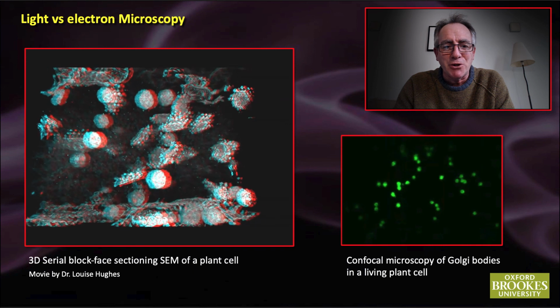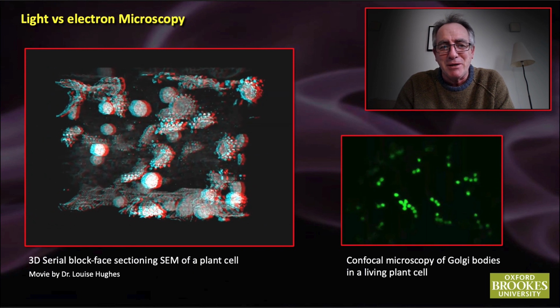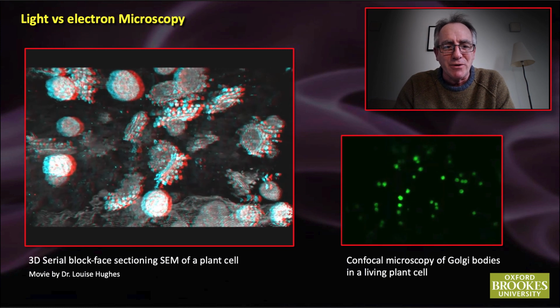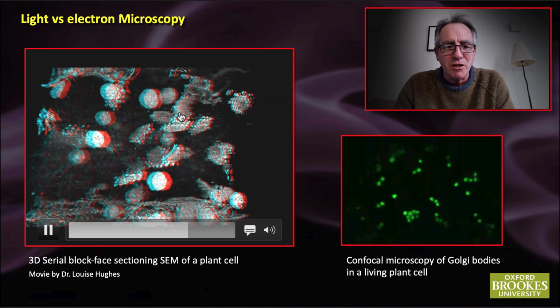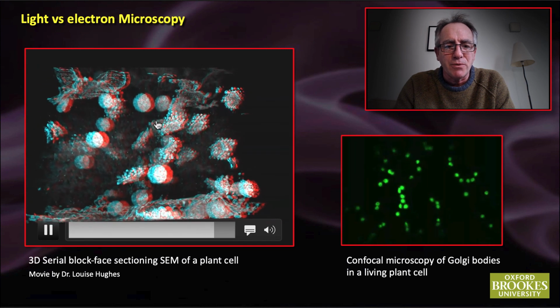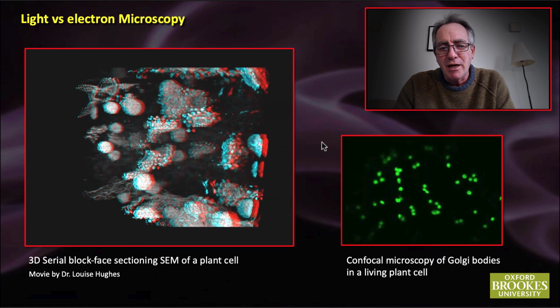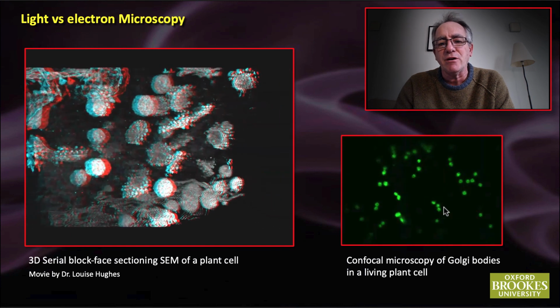To me, there's just a wow factor in that. That's absolutely gorgeous. I mean, it looks like pin sharp, and it feels like you're down inside the cell if you're wearing the 3D glasses and can really see it. So we're seeing electron microscopy resolution of 3D reconstructed Golgi bodies there in fixed and killed cells, and we're seeing the little Golgi bodies doing the stuff of life here in the confocal image.